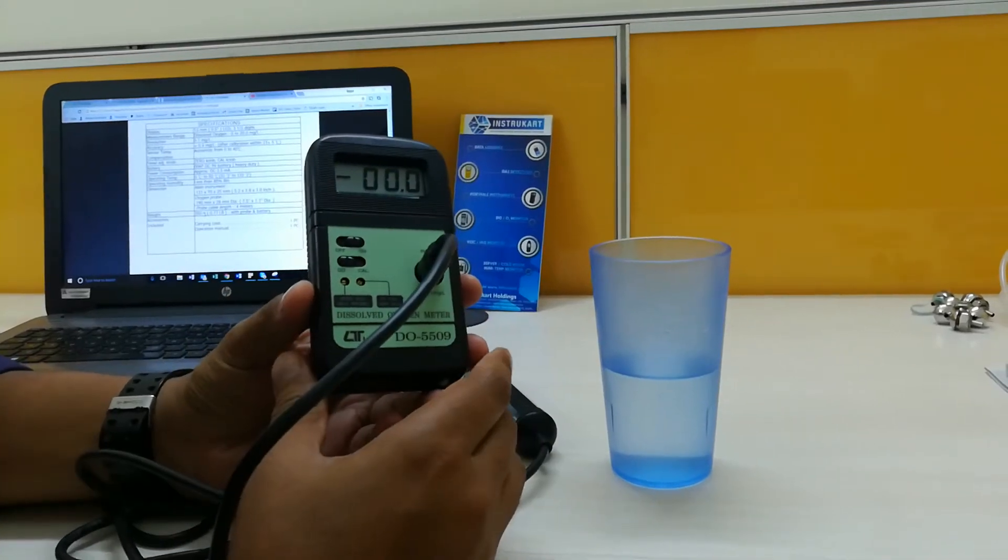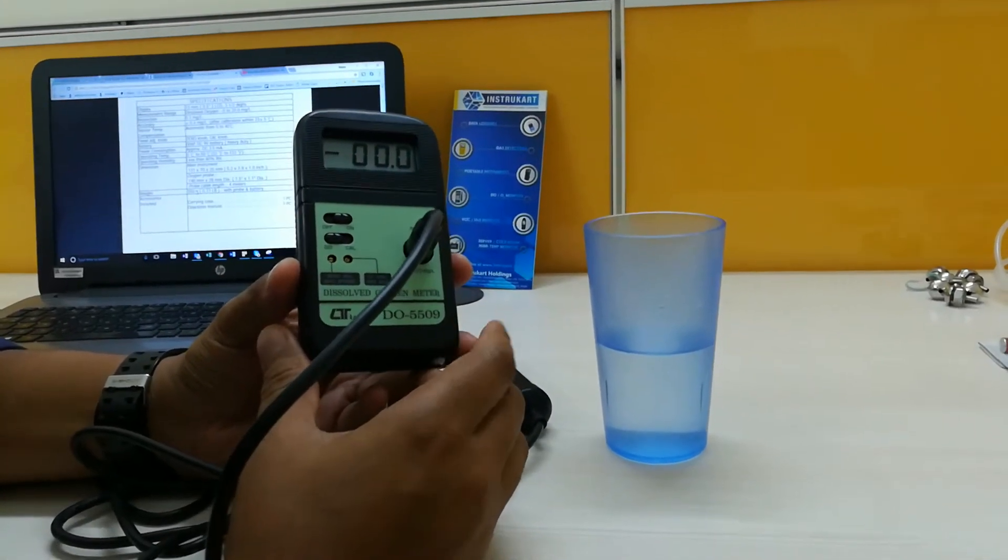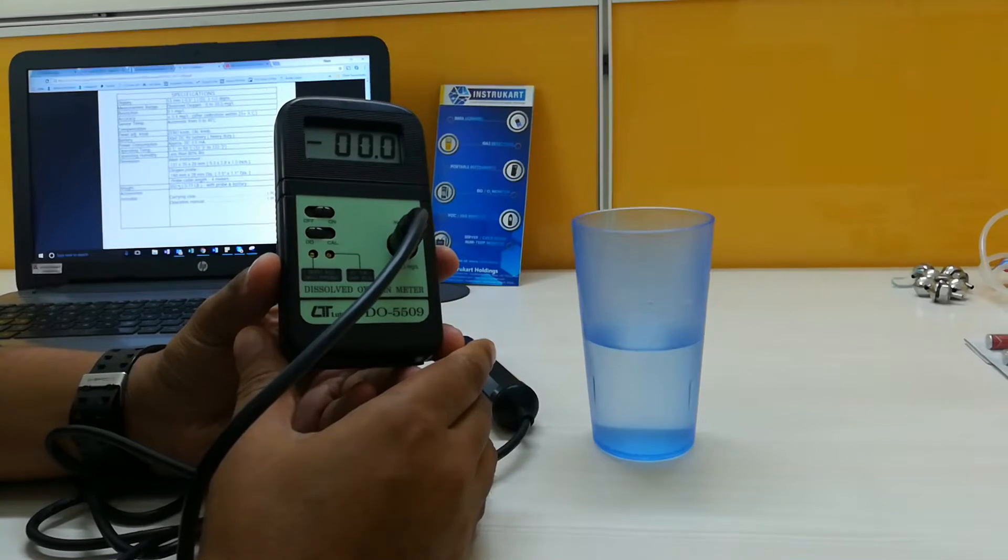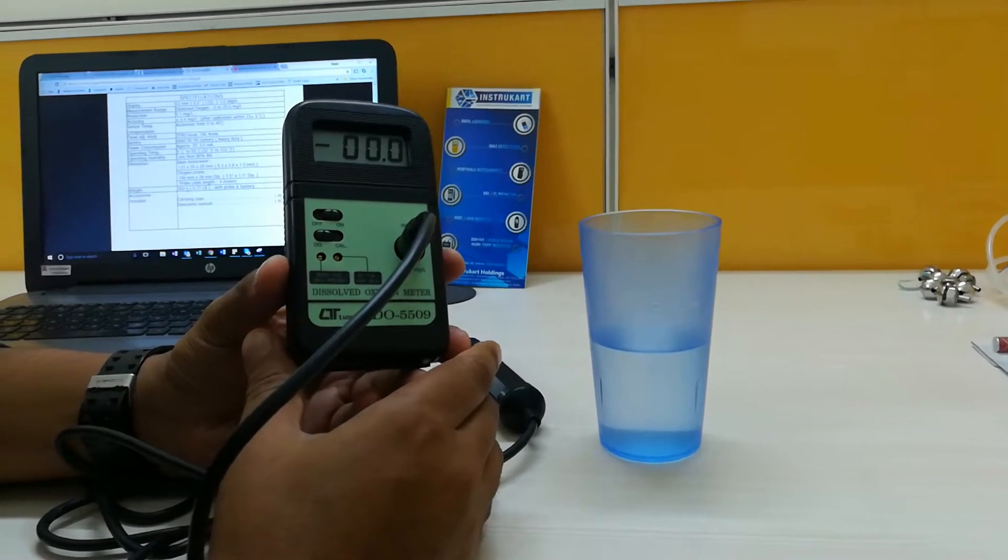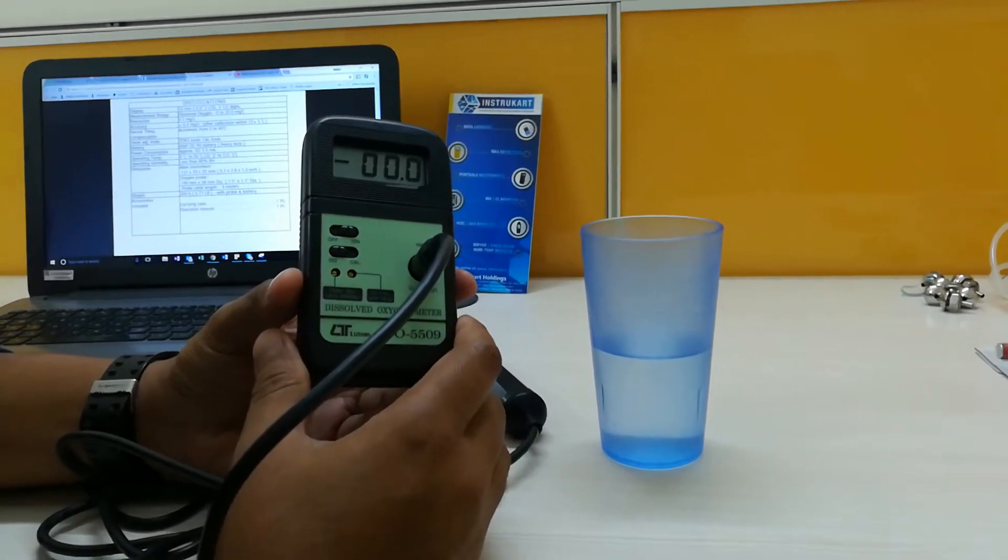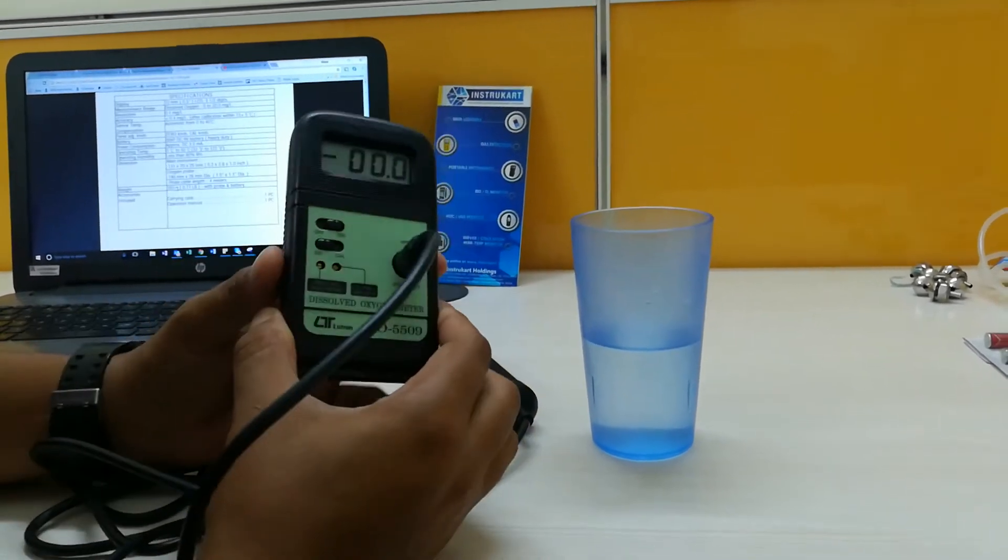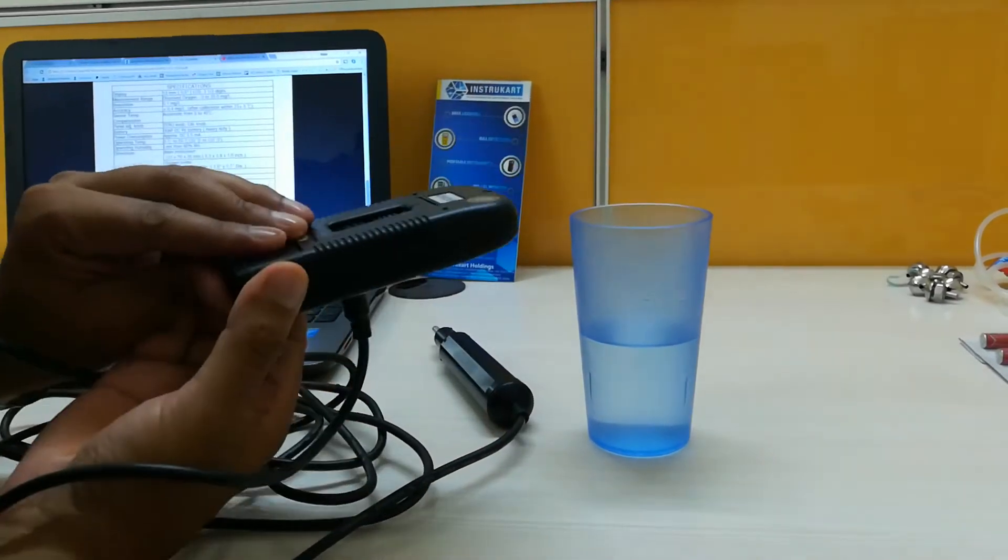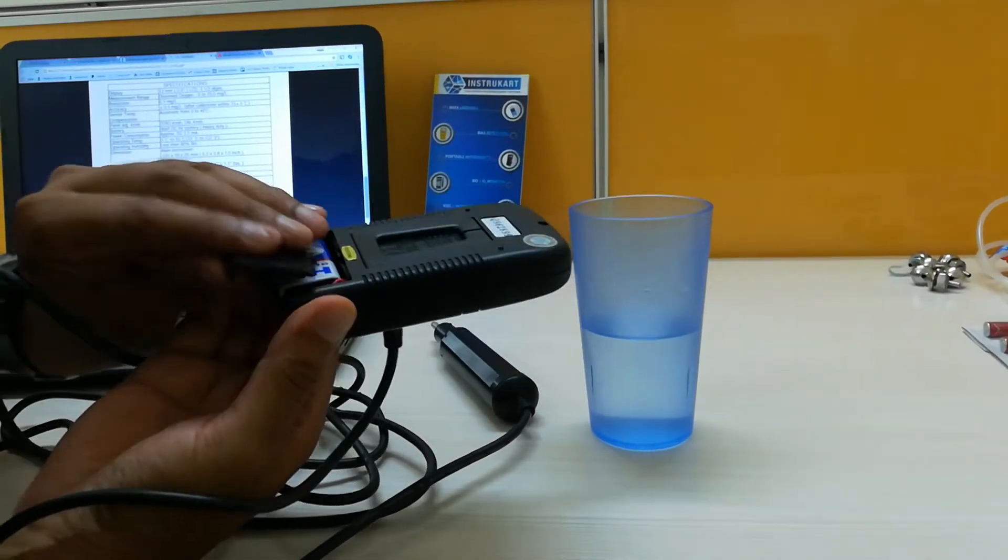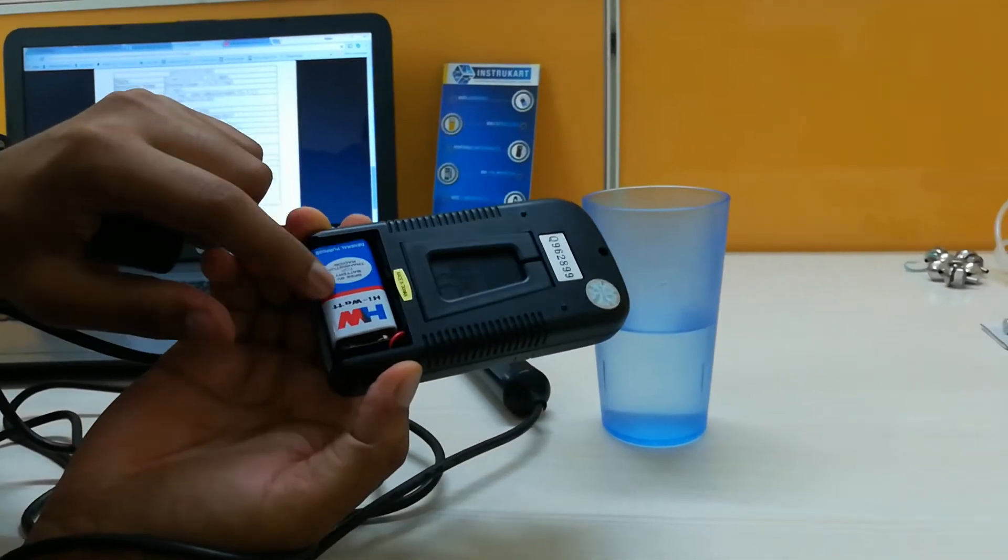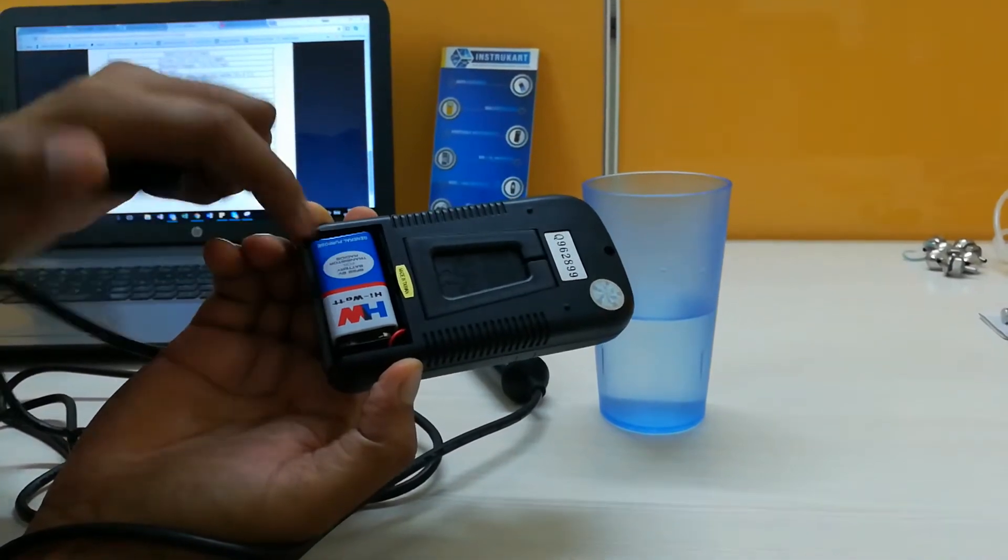Hello, I am going to walk you through the Lutron DO5509 Dissolved Oxygen Meter. This device runs with a 9-volt battery, looks similar to this.